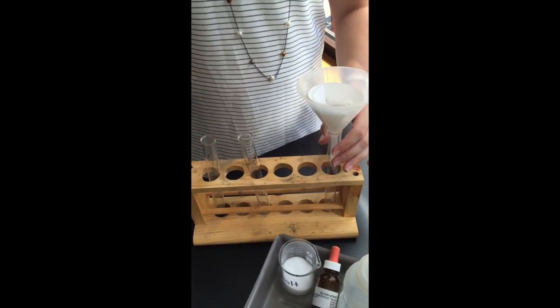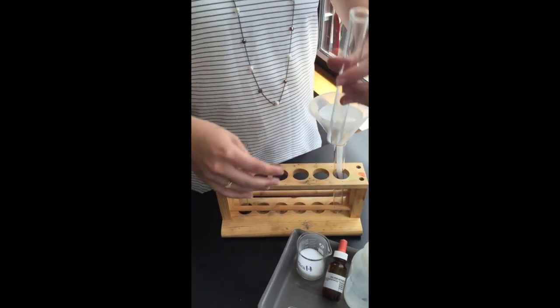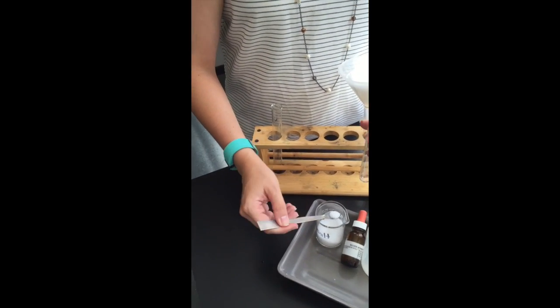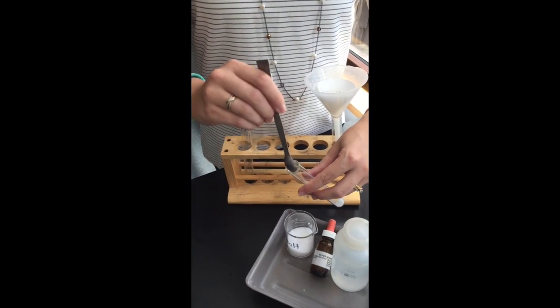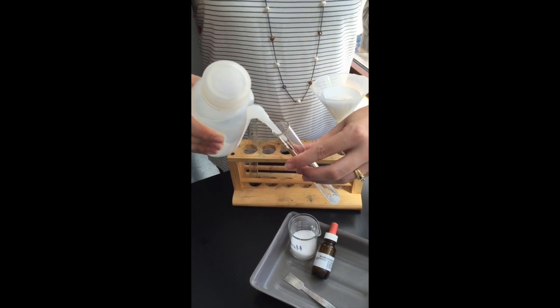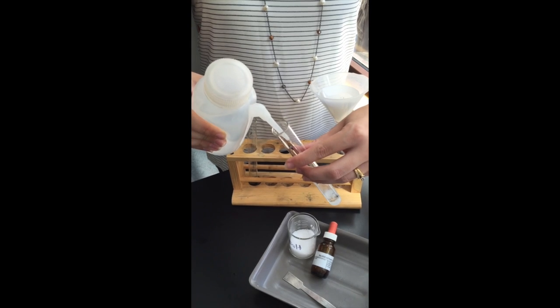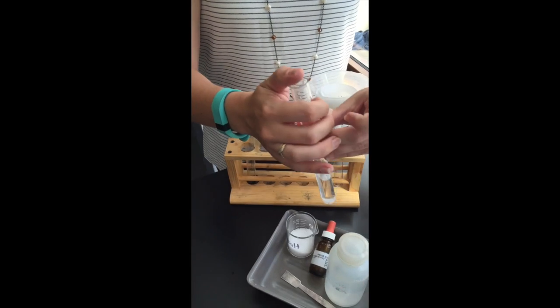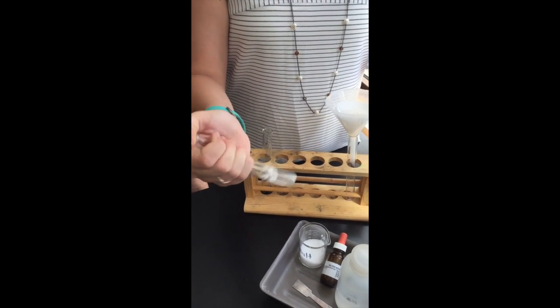While that's filtering, grab some salt and put it in the bottom of a test tube. This is just as a control so we can see what actually happens when we add the silver nitrate to the salt, and compare that with the soil to determine whether we've got chlorides in our soil or not.